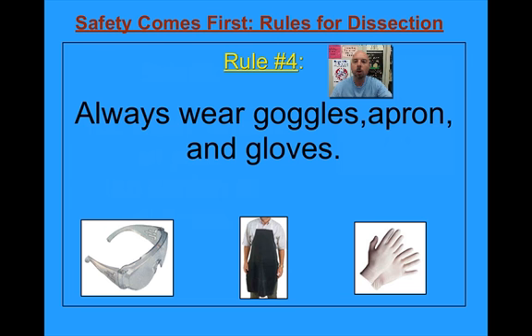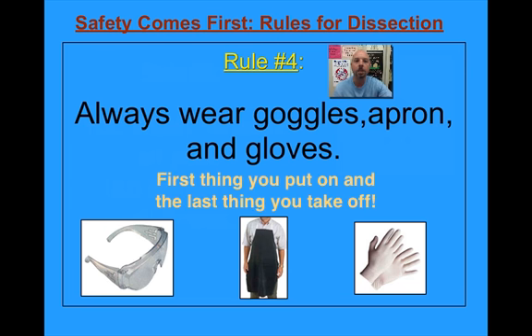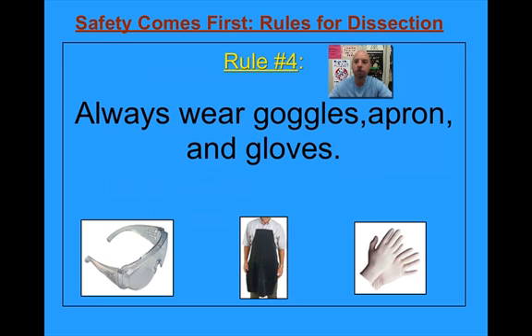Rule number four is always wear your goggles, aprons, and gloves. All of the specimens that we're going to be looking at are preserved, which means that they have been soaked in chemicals in order to keep them from breaking down and decomposing. It's all fun and games until you get those things on your clothing, on your skin, and of course in your eyes. So we do always need to make sure that we're wearing proper safety equipment. Goggles and aprons are available in the classroom, and I will have gloves available for everybody once we begin dissections.